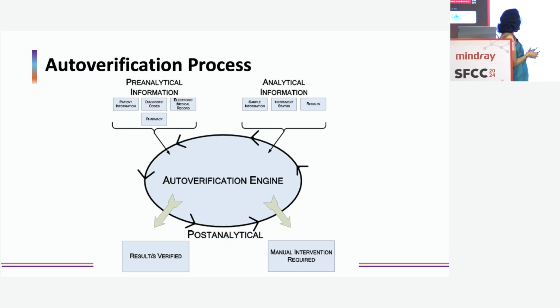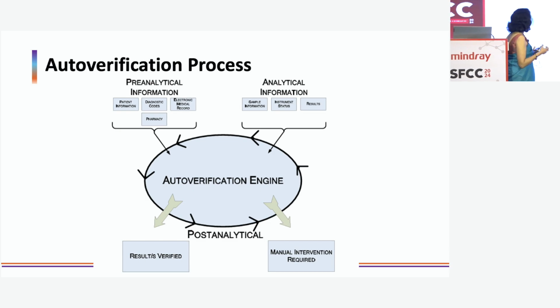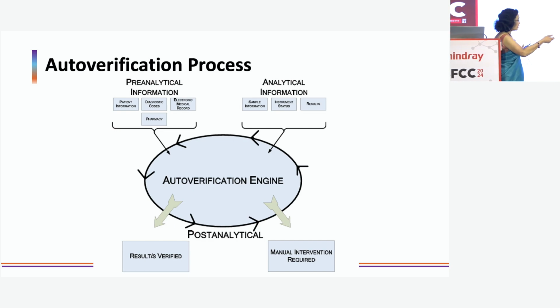So what will the auto verification engine really do? It will take the pre-analytical information and the analytical information, that is the sample information, instrument status, and the test result values, and then it will decide whether it can auto verify a particular result or whether manual intervention is required.